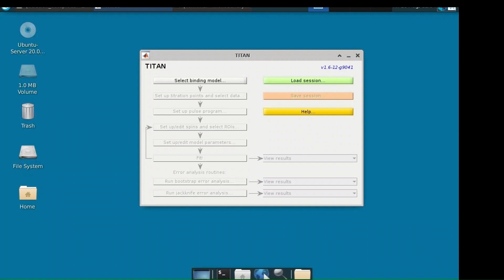You can load processed data files into Titan using either NMR pipe or BRCA topspin. Make sure that all spectra are analysed in the same way. If NMR pipe is used, process using the linear and exponential window functions. To improve time taken for Titan analysis, make sure to only extract 1H chemical shift ranges between 7-10 ppm.